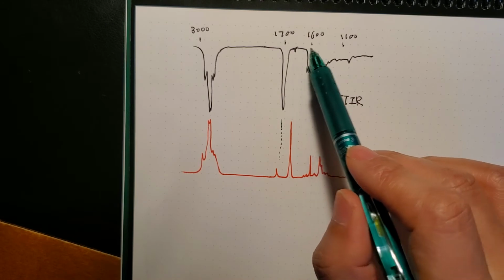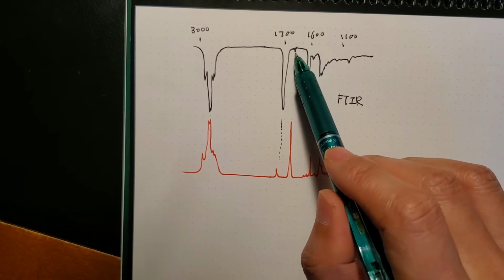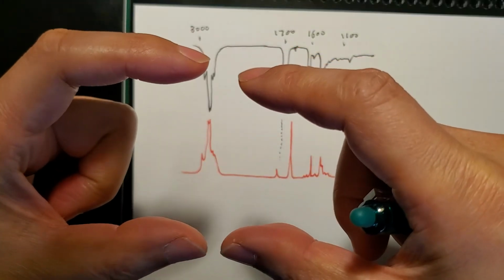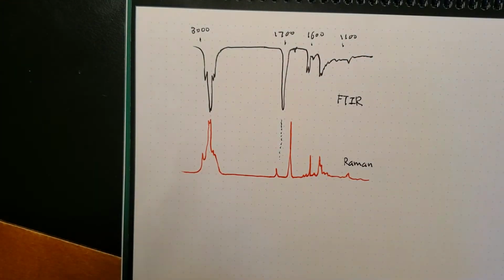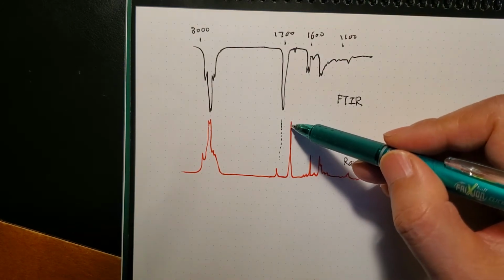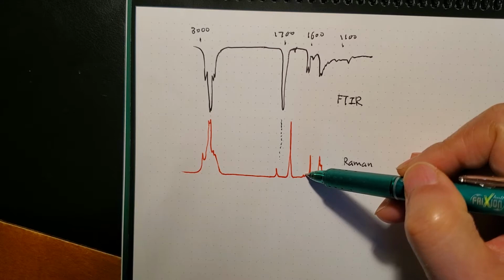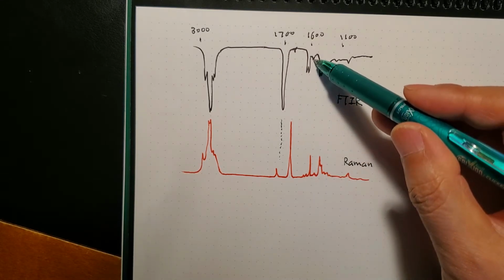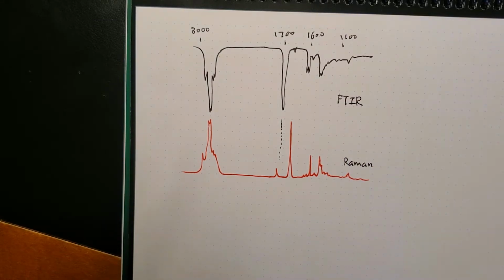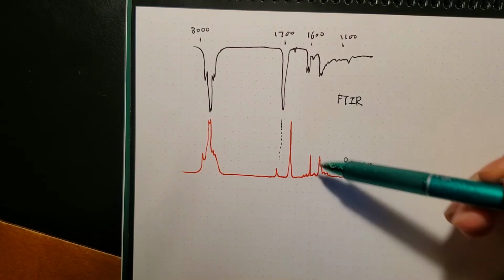And then some carbon-carbon double bond stretching, which I think we mentioned earlier, the symmetric vibration of the ring, this mode, is weak here, but it can come out big in the Raman like this. And this one is stronger in IR than Raman, but this small one can show as a bigger signal, and so on. As you can see, there are some complementary signals, right?